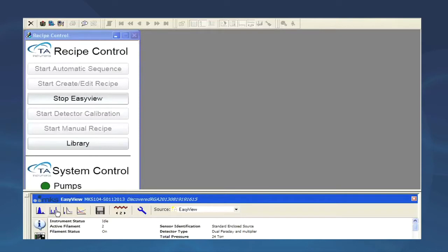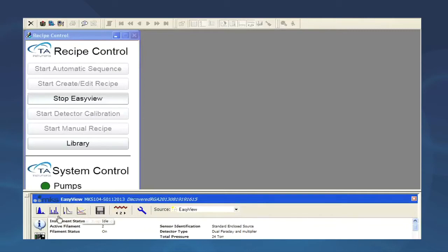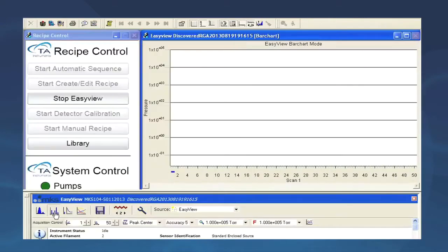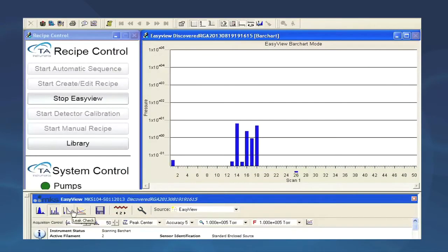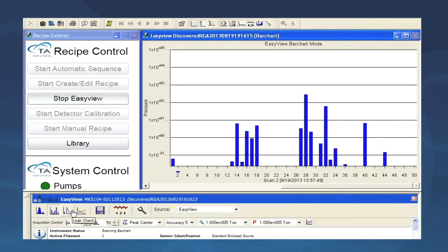There are two icons that allow us to access the bar chart and peak jump trend modes. Choose this icon to activate the bar chart mode. This will display a real-time scan of the ions being detected by the mass spectrometer.